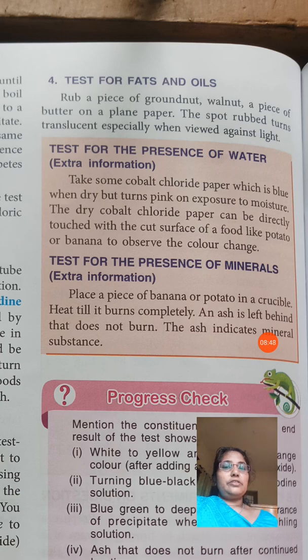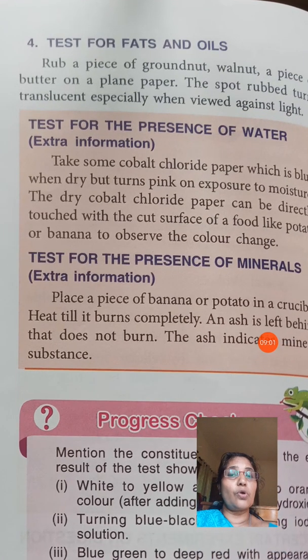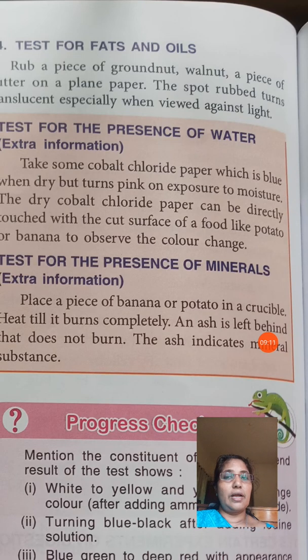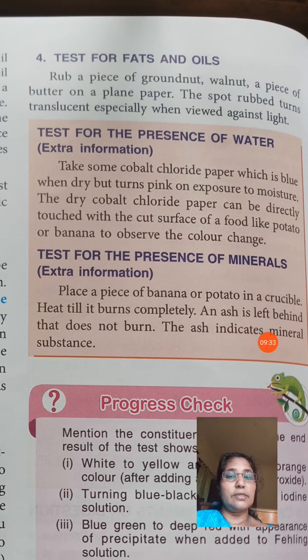Then test for the presence of water. Cobalt chloride paper. If you want to know whether any food particle contains water content, using cobalt chloride paper, when it is dry, that paper will be blue in color, and it will turn into pink color if the food contains water. You can test for water this way.